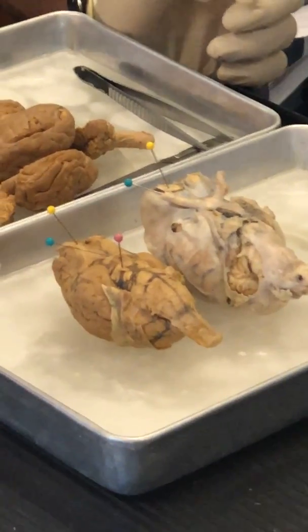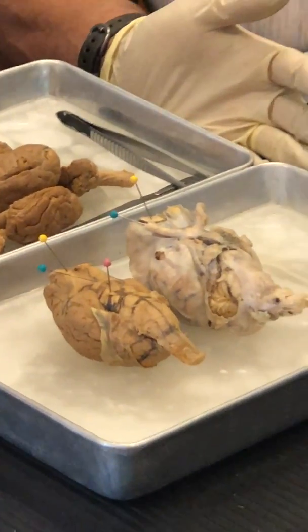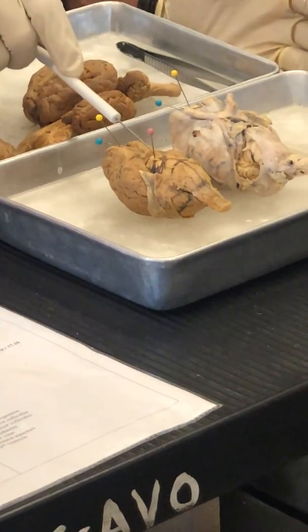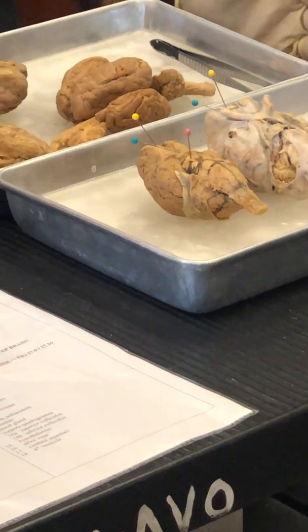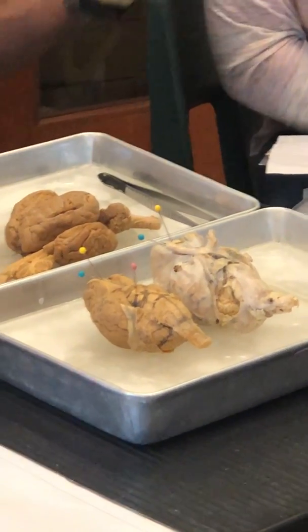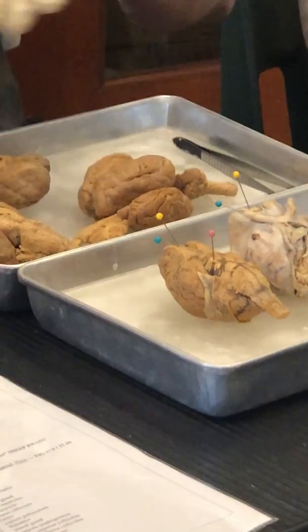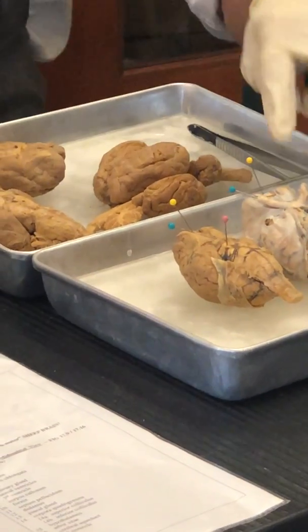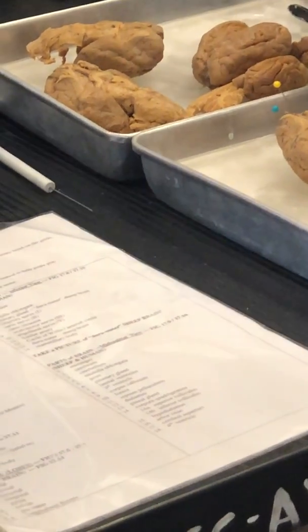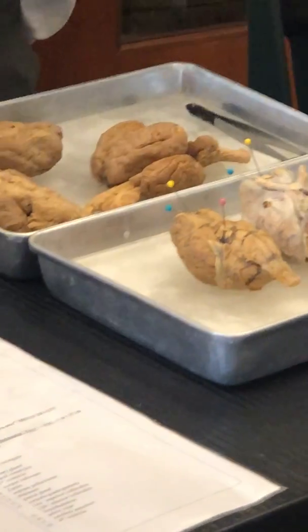Here. Why can't I see it here? Because on the dura mater brain we have that structure that covers that. And we're going to get to that structure in a minute. Alright? So here now you see the difference between a brain that has the dura mater on it and a brain that does not. Right? Remember, you don't have that brain in your lab manual, so you need to make sure you have these recordings, pictures, etc. Alright?